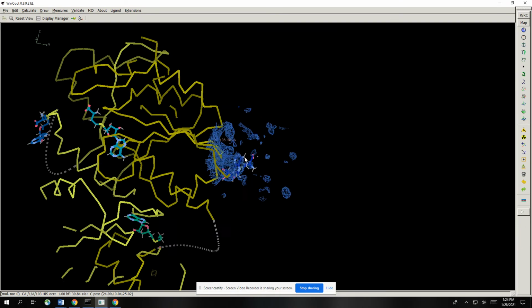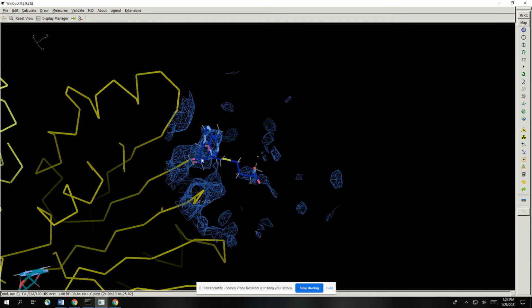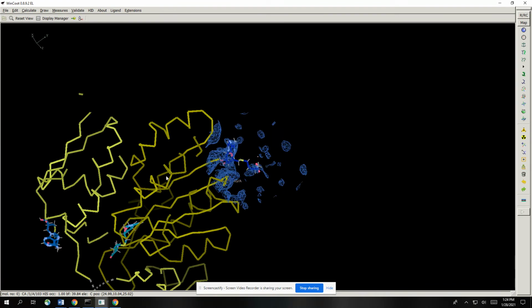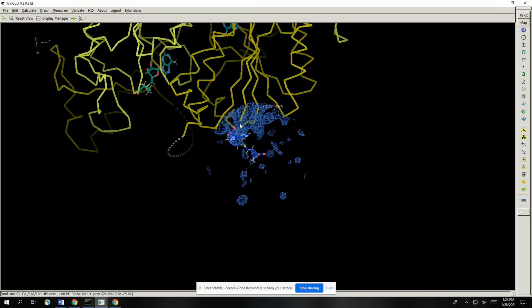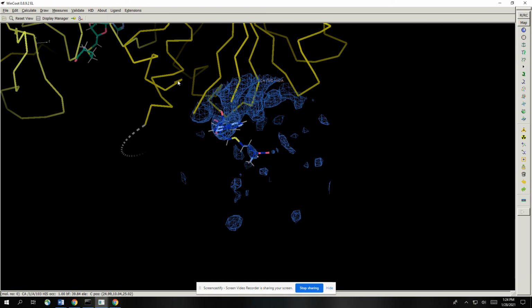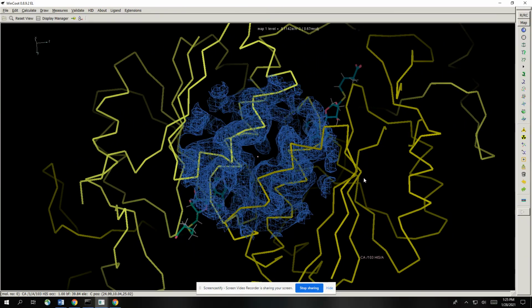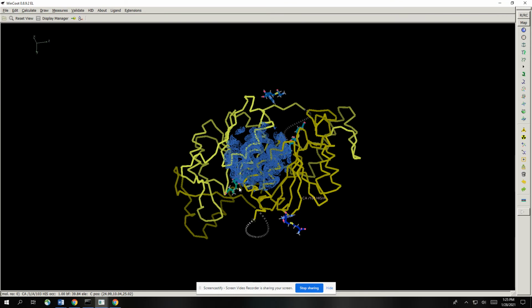And so far, this looks really good. I want to see why we have this here. That might be just some errant ligand hanging out. But the real important part is what's over here. These are the 2 active sites of our protein. So if we zoom out a bit, you can see right here and here is where the active sites are. We actually don't need this molecule. So that is C5. So we're going to delete that.